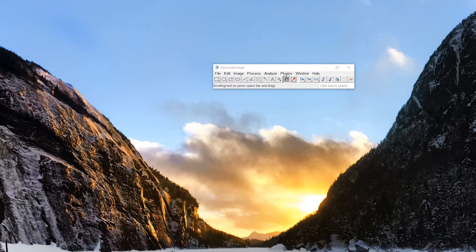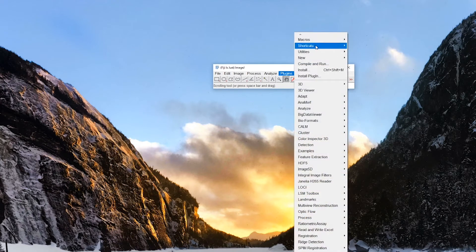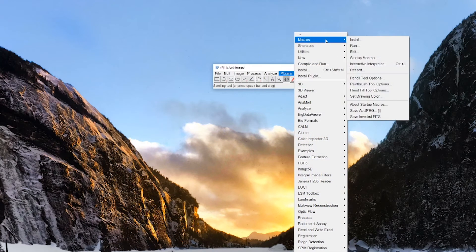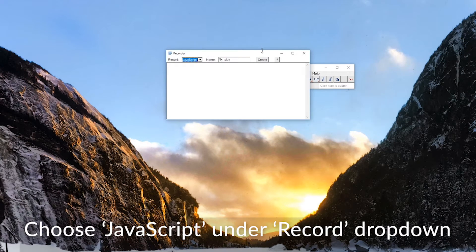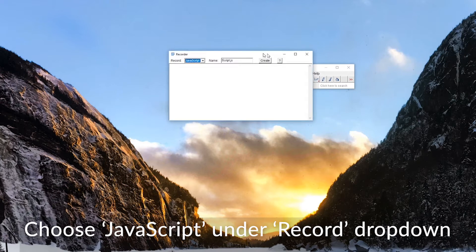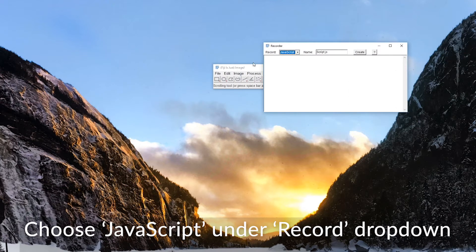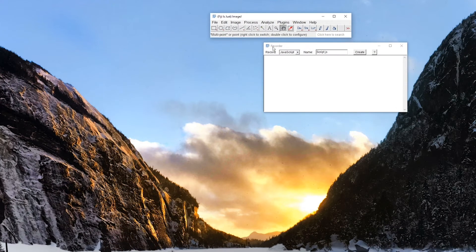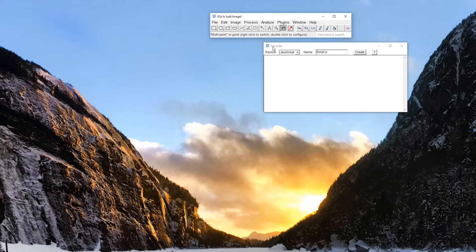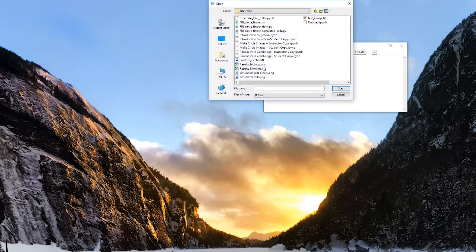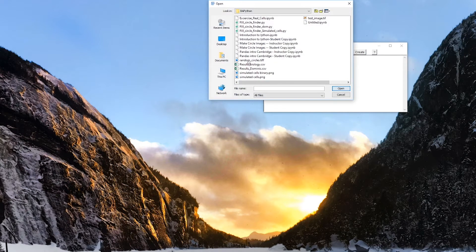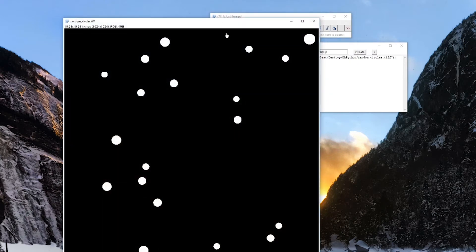So first thing we want to do is under the plugins, macros, we're going to go to record. This is going to help us record what exactly we're doing with the macro. So this is going to give us the syntax that we're going to be using in our Jython script. So first thing we're going to do is open up the image that we saved in our last section, random circles tiff.